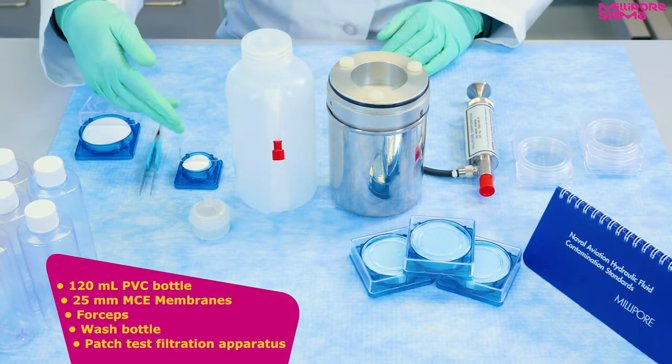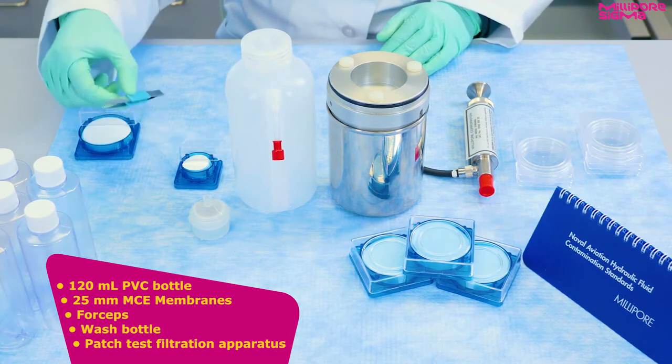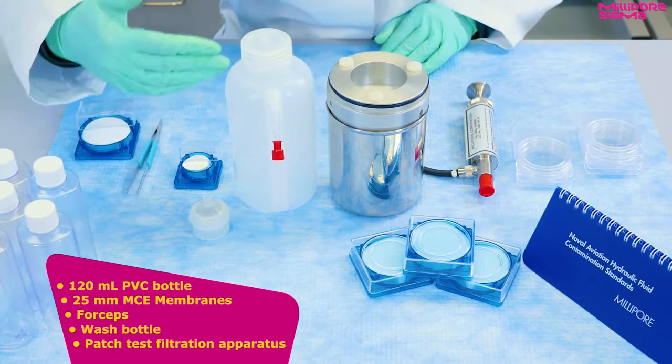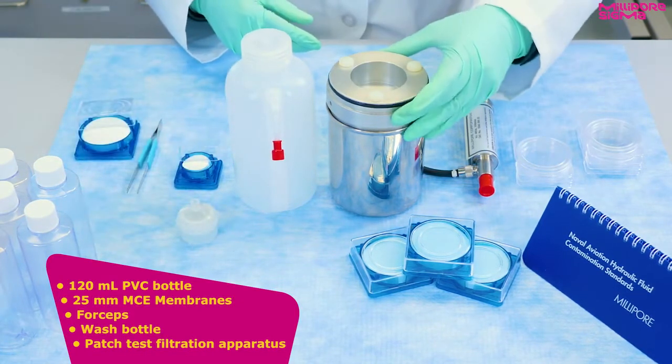In addition to the 47 millimeter membranes, the kit also includes 25 millimeter MCE membranes, forceps, a wash bottle with a 25 millimeter Swinix filter holder, and finally, this is the patch test filtration apparatus.